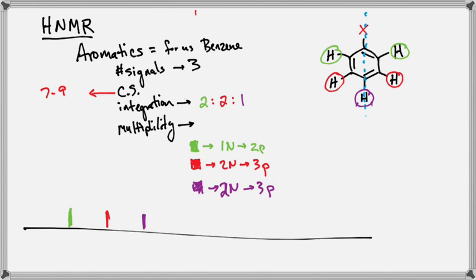We could then go through and deal with all of our splitting patterns, but before we do that, what I want to do is lean a little bit on that camp that said that they had 2 hydrogens. How different is the red hydrogen from the purple hydrogen? Chemically.